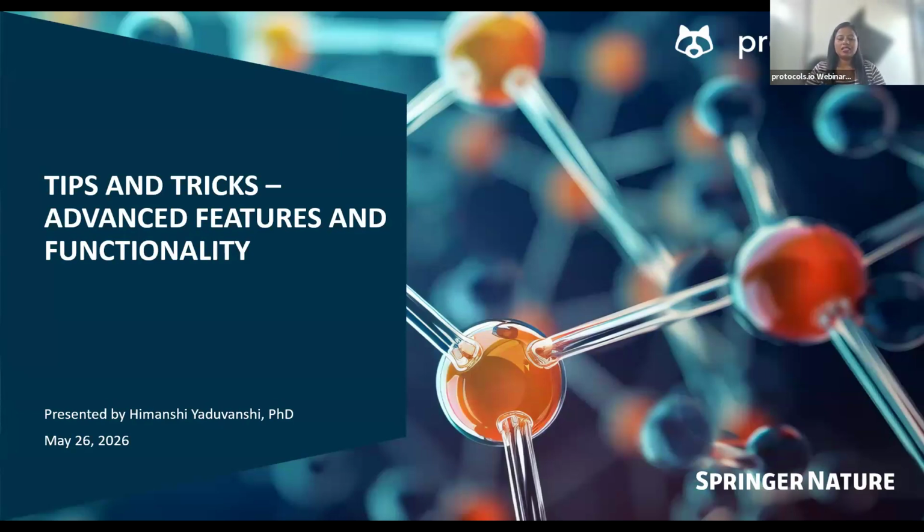So today in this webinar, I will be talking about the advanced features and functionalities of protocols.io. For those who are new to protocols.io, please note that we will skip some basic overview covered in the introductory webinar, which is a different webinar. However, you can attend the upcoming sessions or view the existing introductory sessions available on our website. So let's get started.